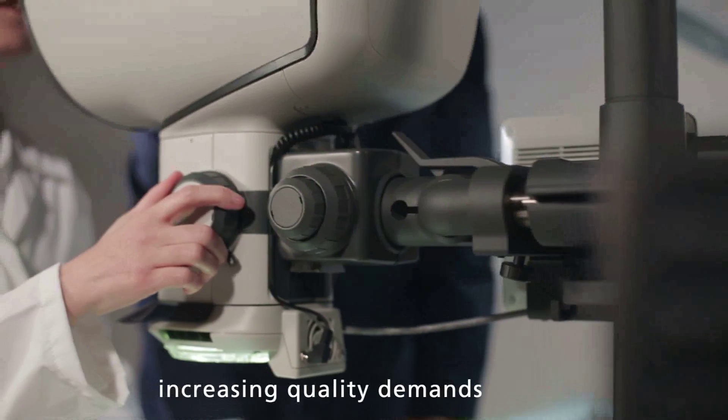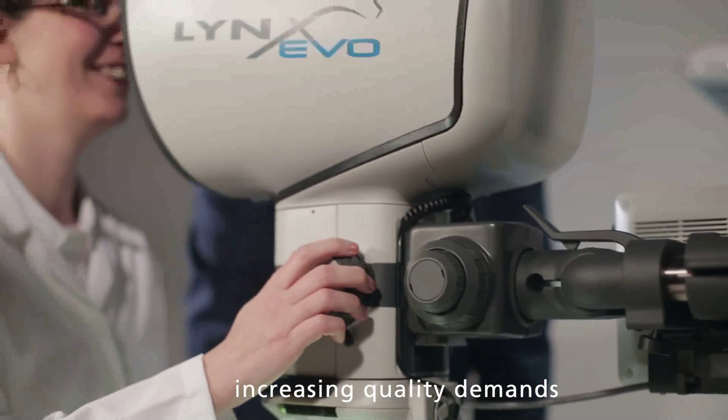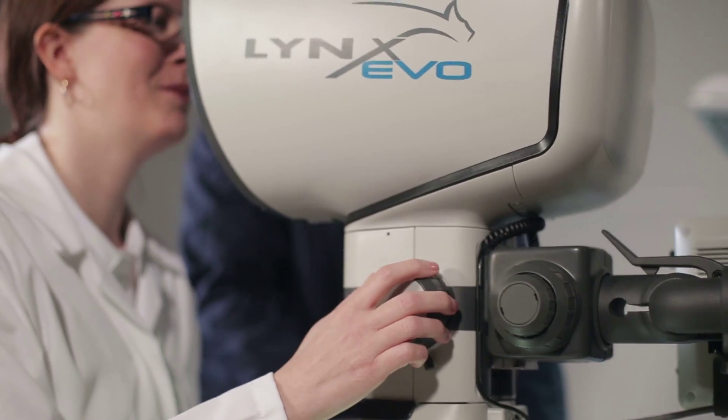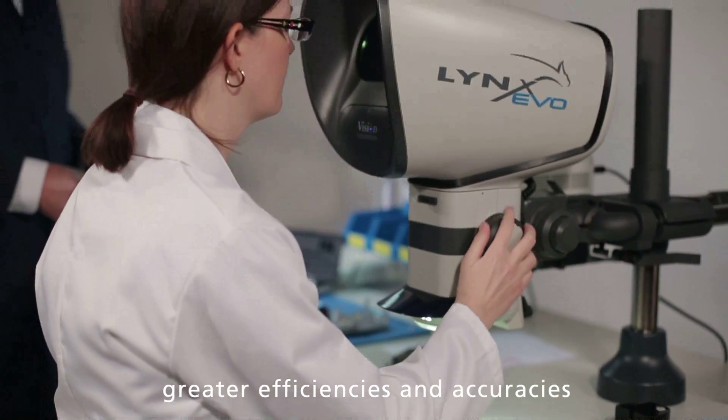For over 50 years, Vision Engineering Limited has pioneered cutting edge optical developments, helping the world's best companies overcome the challenge of increasing quality demands, smaller components, greater efficiencies and accuracies.